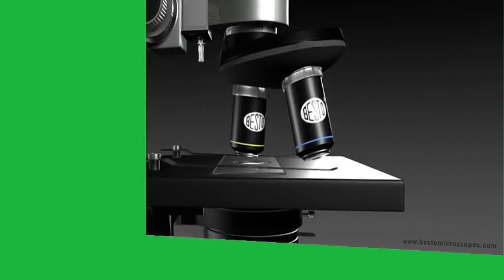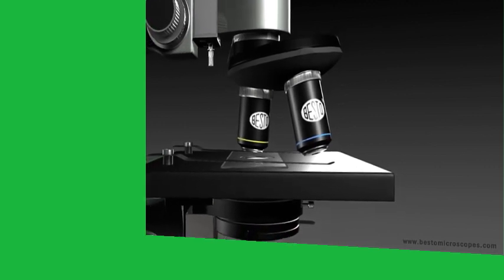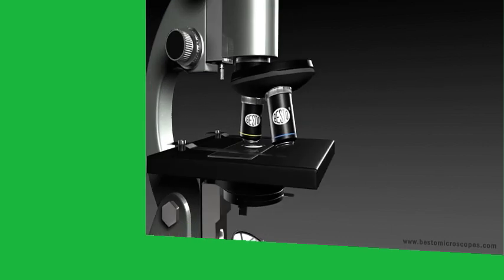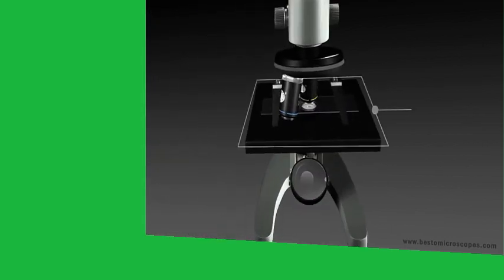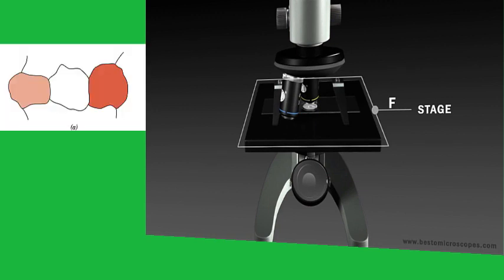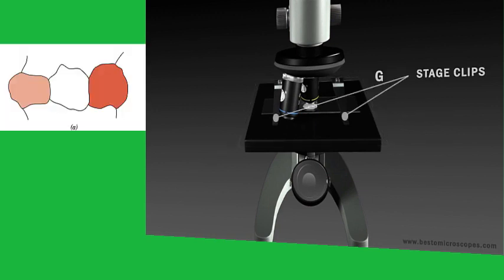Also, small grooves form along grain boundaries as a consequence of etching. Because atoms along grain boundary regions are more chemically active, they dissolve at a greater rate than those within the grains. These grooves become discernible when viewed under a microscope because they reflect light at an angle different from that of the grains themselves. This effect is displayed in Figure A.